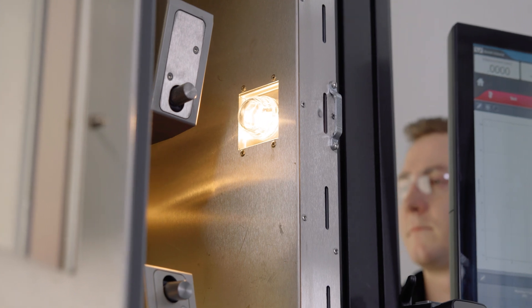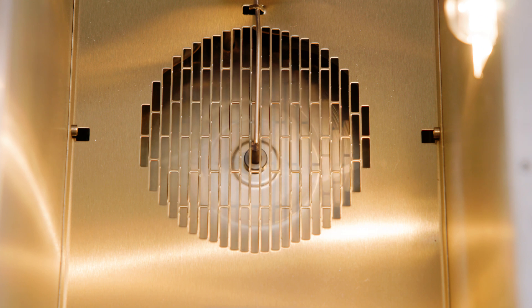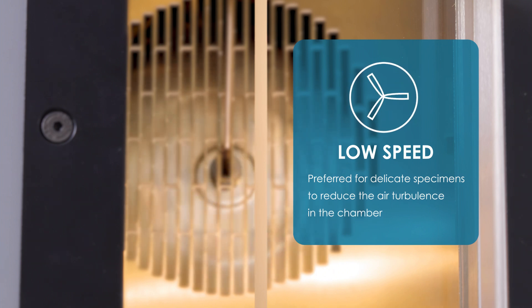Inside the chamber, we have a light that makes it easy to see the specimen when the chamber door is closed. There are also fans that circulate the air to bring the chamber up to temperature quickly, provide thermal stability, and reduce thermal gradients. The fan speeds can be set to high or low. Low speed is often preferred when testing delicate specimens where you'd want to reduce the effect of air turbulence within the chamber.